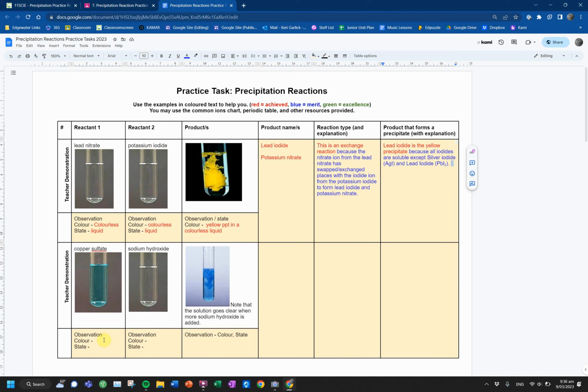With some of those reactions, you just need a little bit of time to watch the precipitate sink and confirm the color of the solution. So do keep that in mind. When you are stating your observations, you are stating both what's solid and what's in the liquid.